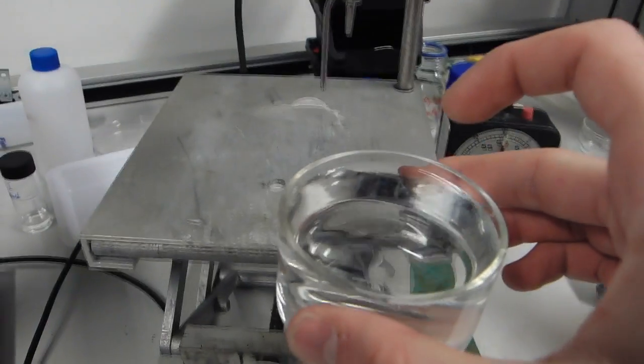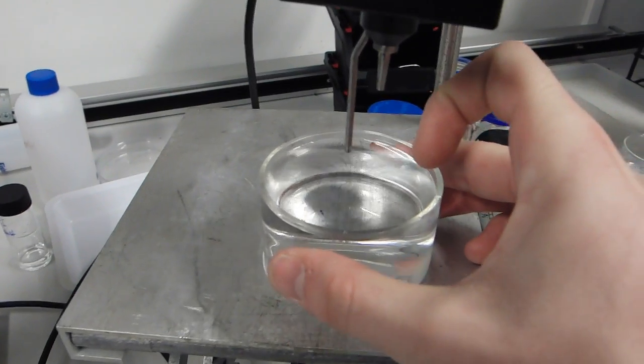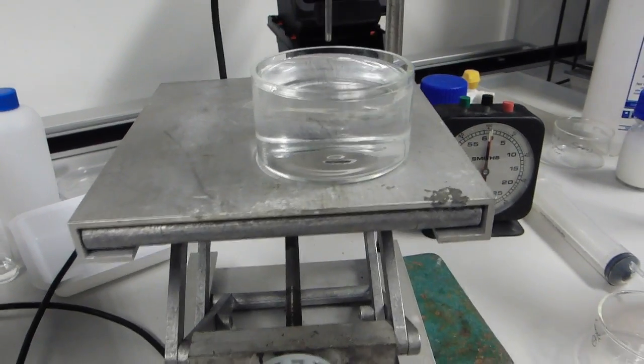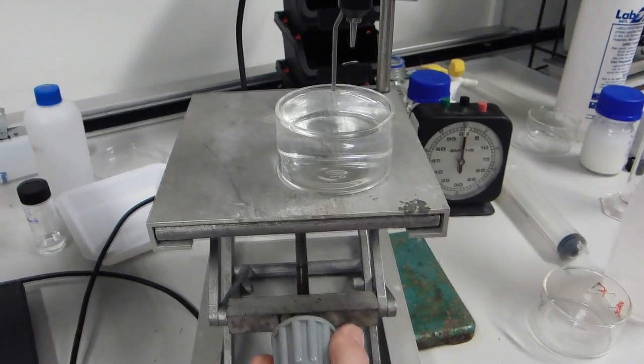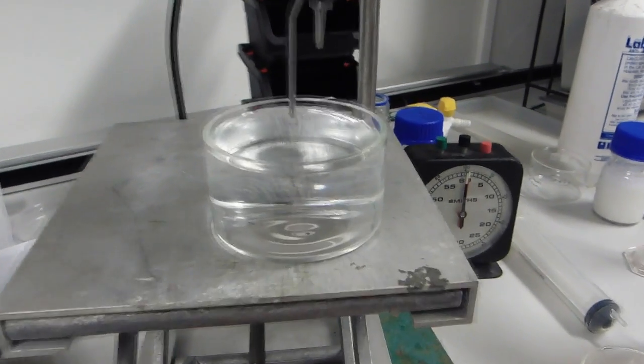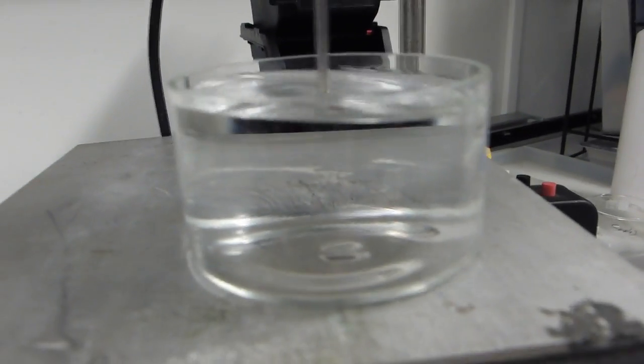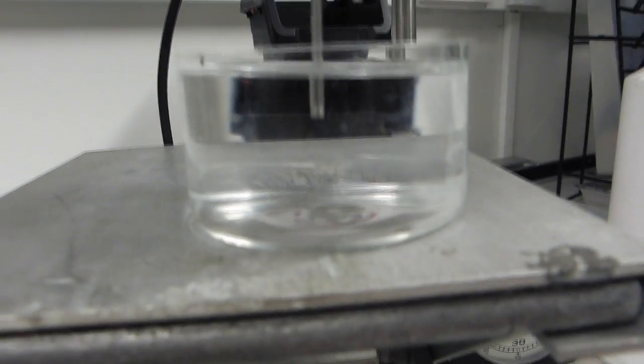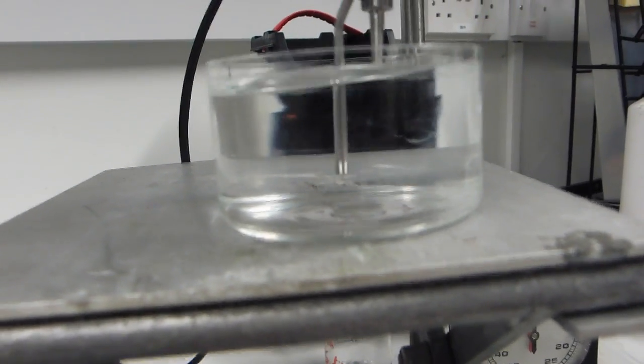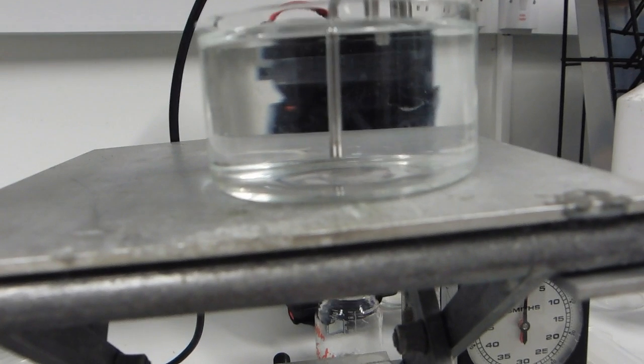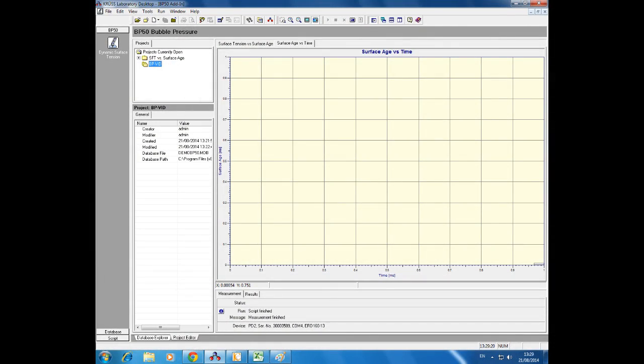The sample is placed on the stage and raised into position. The software can then be used to begin making measurements.